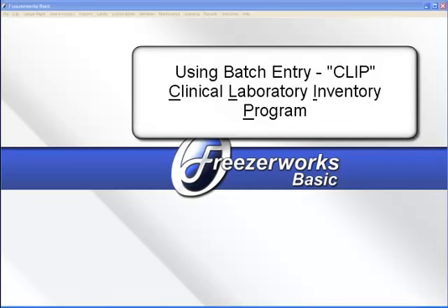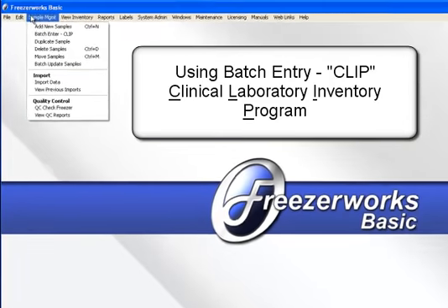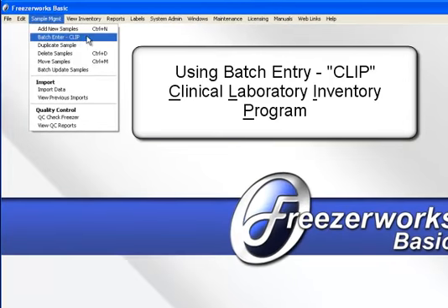Batch entry is an option in Freezerworks Basic. We also like to call it CLIP, batch enter CLIP. And CLIP stands for Clinical Lab Inventory Program, or CLIP.